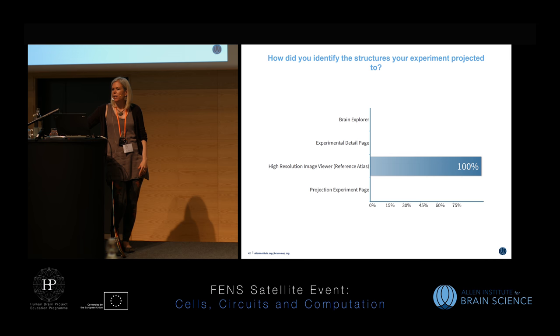Each one of the sections from the injection site was annotated by our anatomists. So if you zoom in and look at the injection site, you'll notice that there is a sphere at each one of the injection sites. You can actually click on that piece of data to open it up and look at what that looks like in the two-dimensional view.